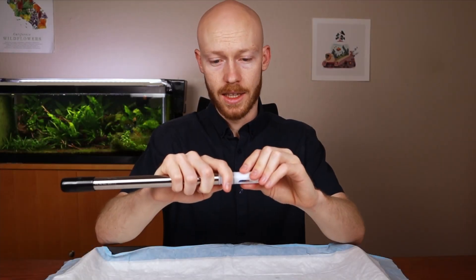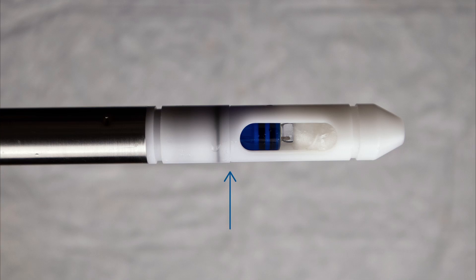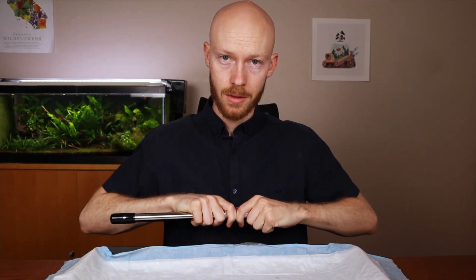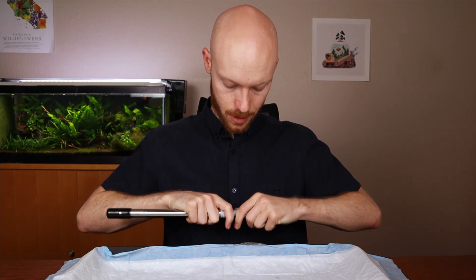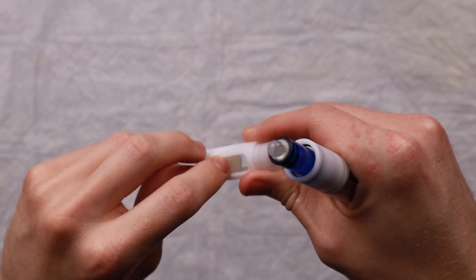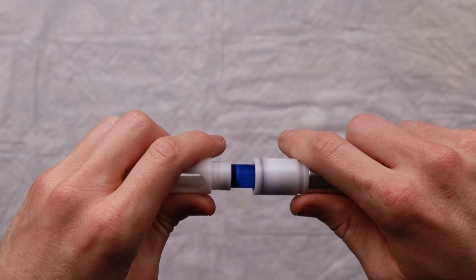Grip the guard and the sensor on either side of the separation seen here. Bring it close to you to maintain control, then slowly pull it apart, being careful to avoid hitting the glass bulb at the end. Once off, remove the cotton ball and snap the guard back in place, again being careful not to hit the bulb.